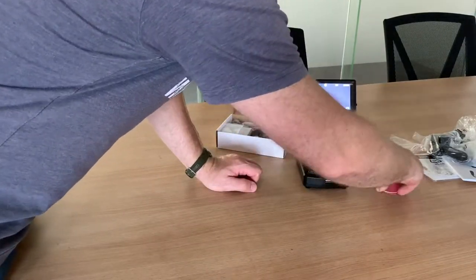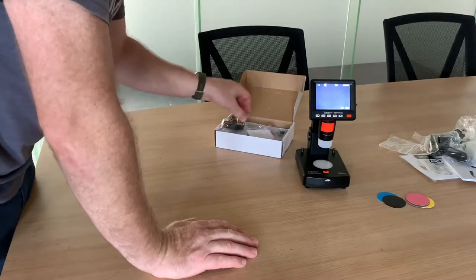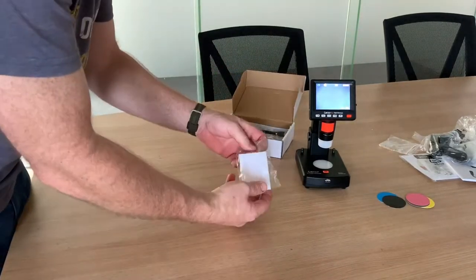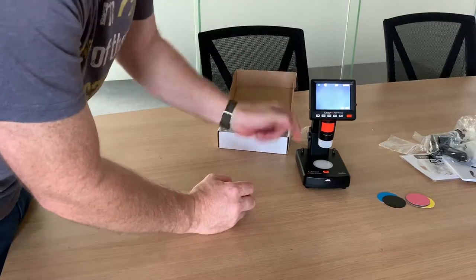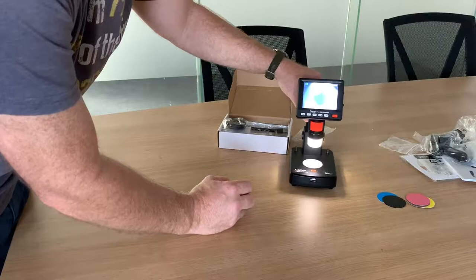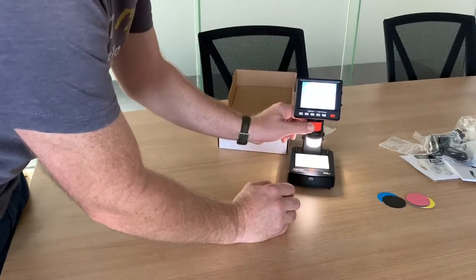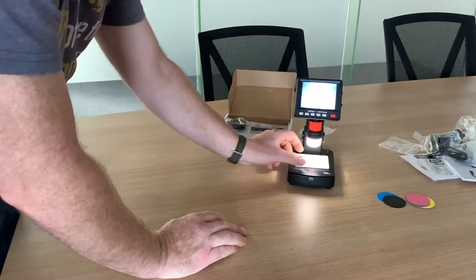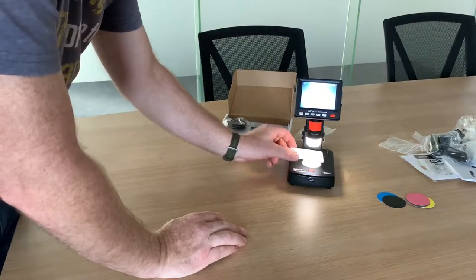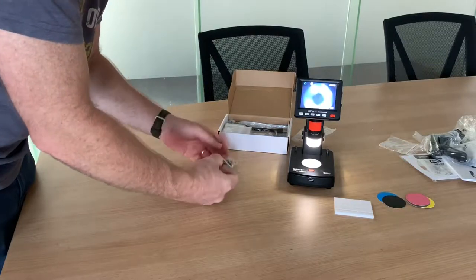I like to use a black one. You've also got the blue stones tray here which illuminates, so you can put loose stones on here and move them around. It's very useful.